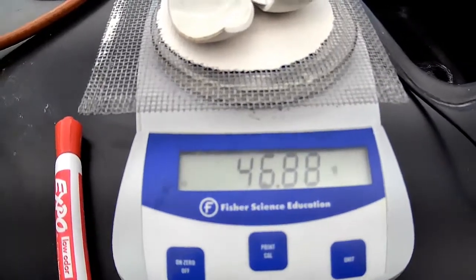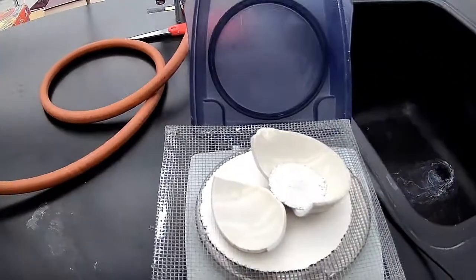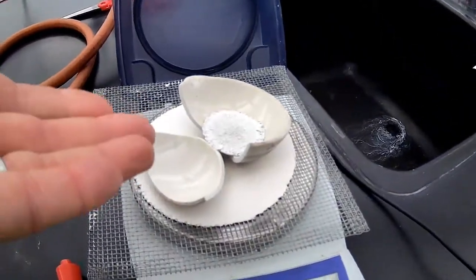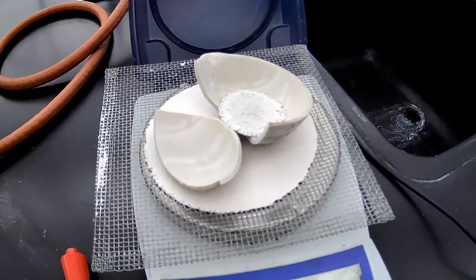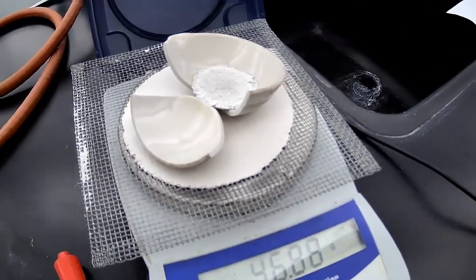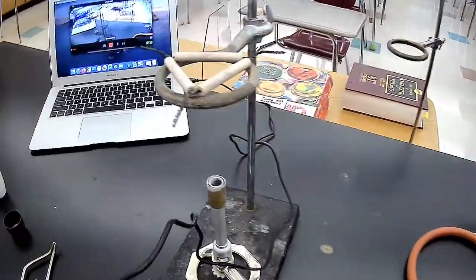And there we go, 46.88. So 0.01 grams off. That is pretty good. Yeah, I broke the evaporating dish. I should probably have left it on the clay triangle a little bit longer.